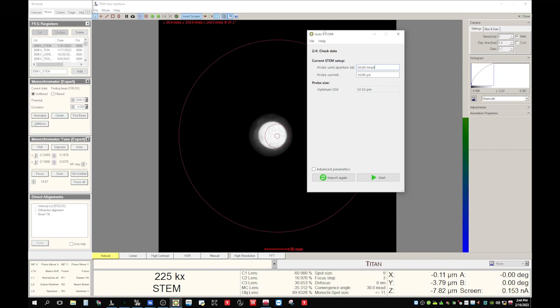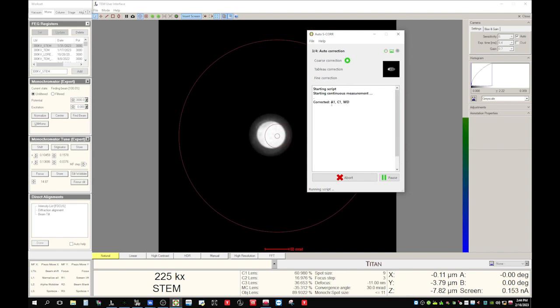Pull up the auto alignment software again and hit 'Start'. Now you see it started trying to align the corrector for us. From now the process is completely automated and you can just take a rest. The whole process will take anywhere from about 10 minutes to one or two hours, depending on how far off the current status is. So let's just wait.